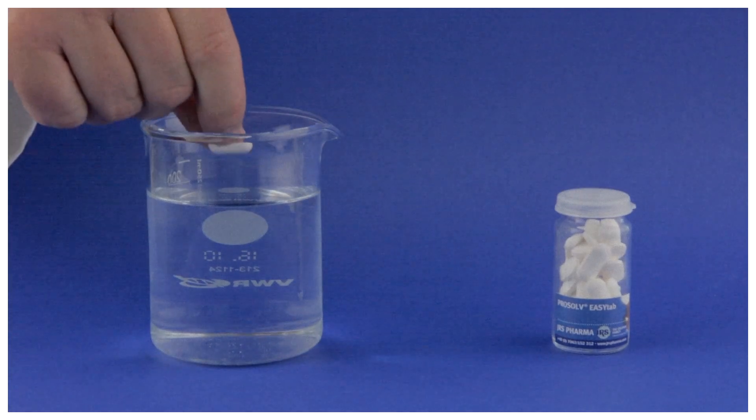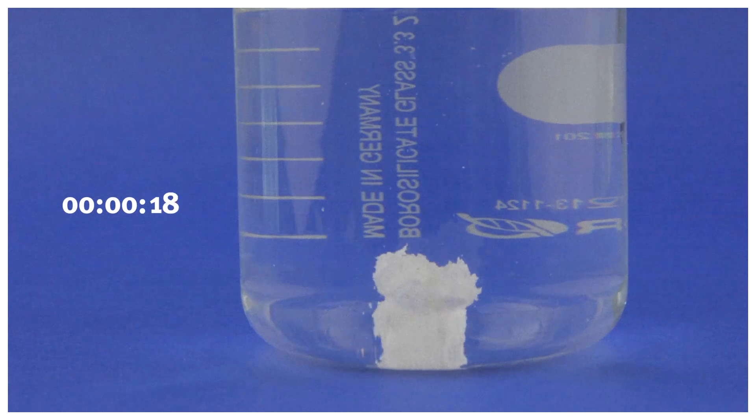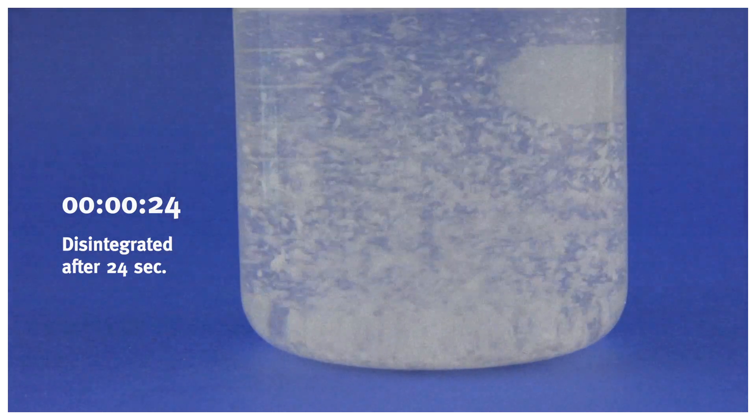Here you can see its quick disintegration, allowing for faster dissolution of the drug. Among many advantages, it disintegrates quickly.